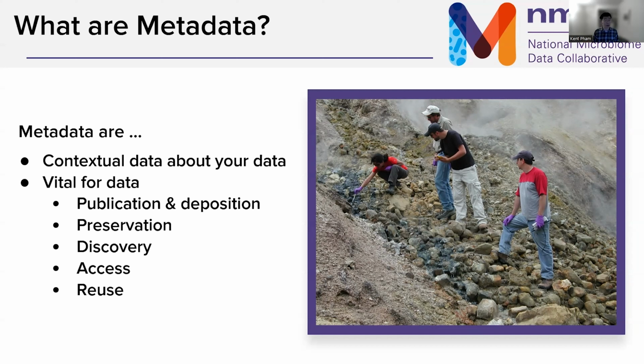As you may remember, FAIR data is findable, accessible, interoperable, and reusable. By ensuring that you have as much quality metadata as possible, you are getting closer to having good FAIR data. With FAIR data, your sample data is findable by other researchers, and they have enough context with it that they can use it for their own experiments, which hopefully gets you another mention or at least a citation. And that's always good for people in the sciences.